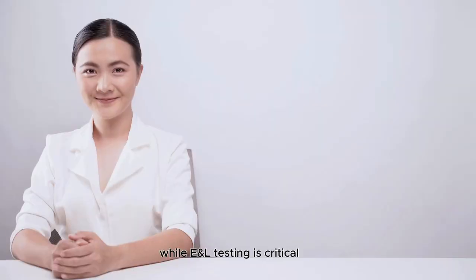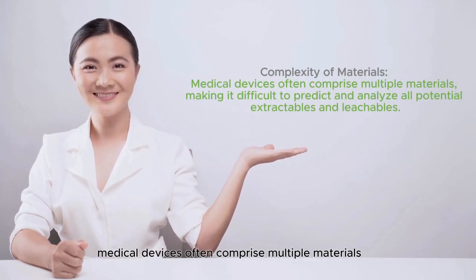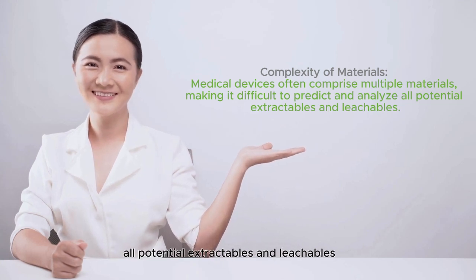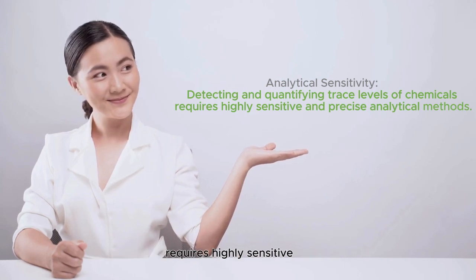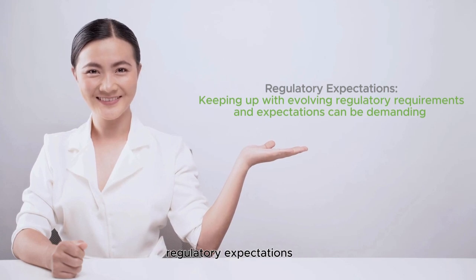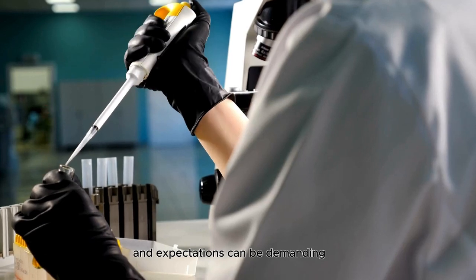While E&L testing is critical, it comes with its challenges. Complexity of materials: medical devices often comprise multiple materials, making it difficult to predict and analyze all potential extractables and leachables. Analytical sensitivity: detecting and quantifying trace levels of chemicals requires highly sensitive and precise analytical methods. Regulatory expectations: keeping up with evolving regulatory requirements and expectations can be demanding.